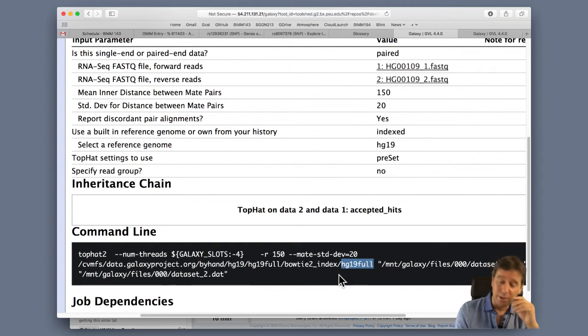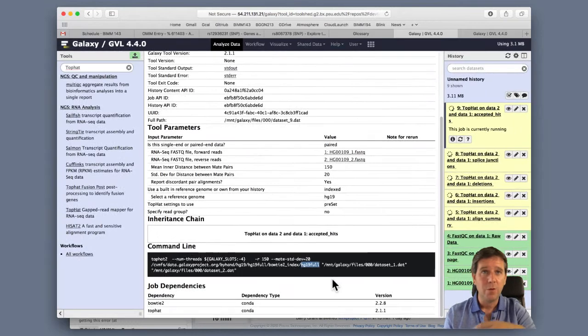As we get more advanced and more settled in our NGS workflows, and we've got a feel for what we're doing and the kind of tools that we want to use, at the end of the day it's going to be more productive to just run it at the command line. Learn Unix and type it in. This will allow you to do more custom, more bespoke analysis. But for now, we're just going to let Galaxy look after these details for us.